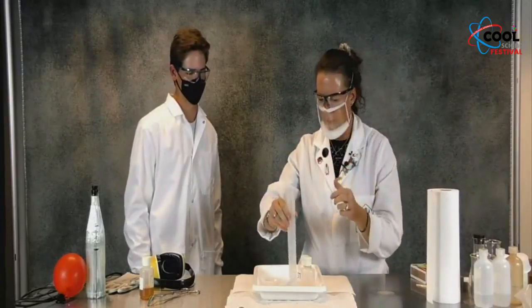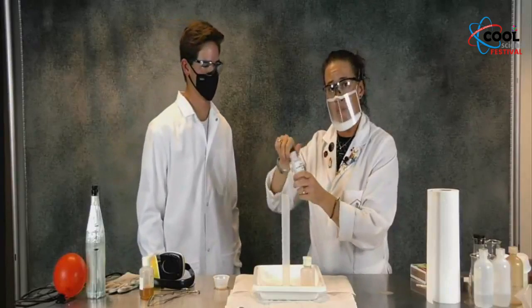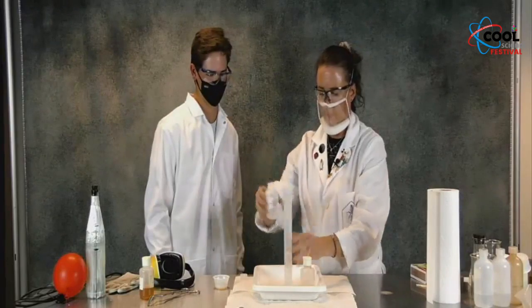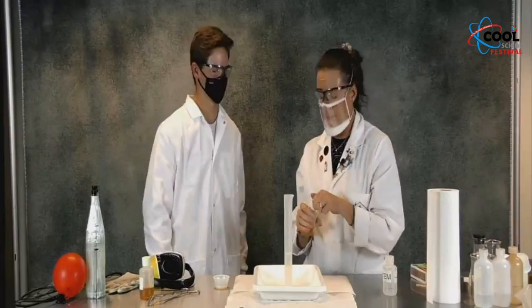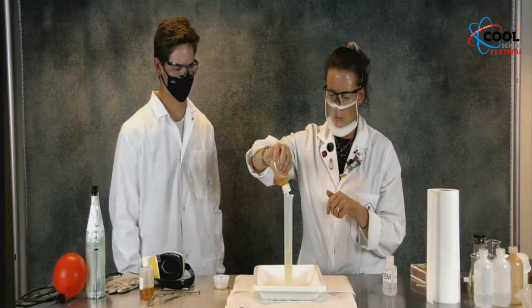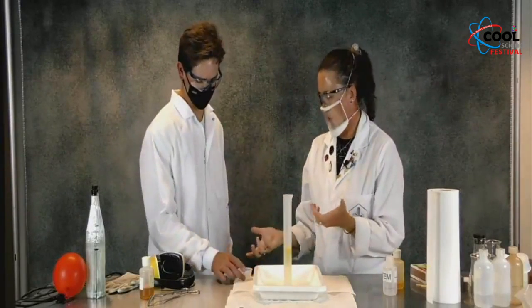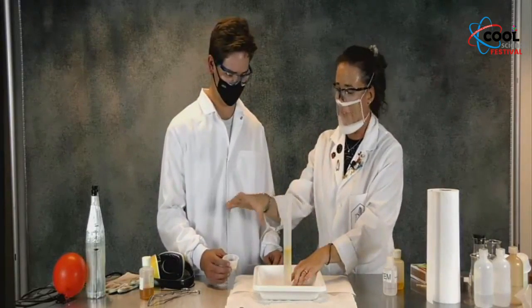So Connor, what we're going to do is take some peroxide. This is stronger than the 3% you can find in your store. This is 30% peroxide. I'm going to pour this in here. We're going to add some dish soap because dish soap is really good at trapping gases. And because we don't want this to launch into their ceiling. It's not really as much fun that way. What I want you to do is hold this in your right hand as your pouring hand, right? You're going to pour it quickly and carefully in there and then just set it down. Are you ready? Go ahead.